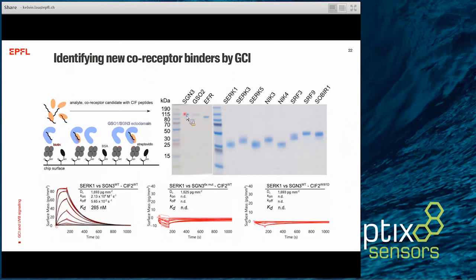So he incubated SCHENGEN3, similar to what was described before with ABA-type injections for receptors, to save on the amount of peptide ligand. He injected that into the buffer, and then he screened a diverse set of potential co-receptors, which he could then identify as another SERK receptor, the same SERK receptor as the BRI1 co-receptor.